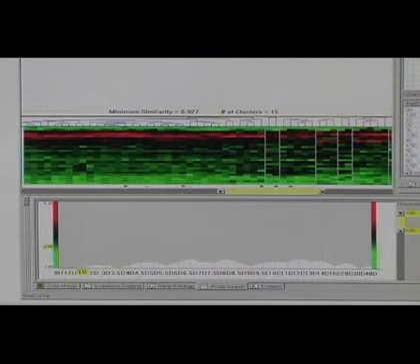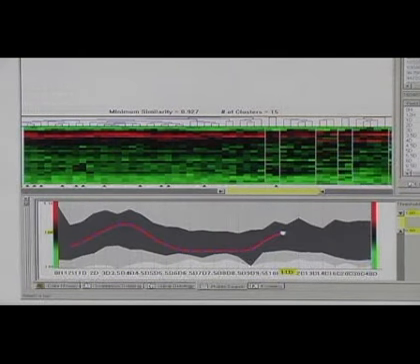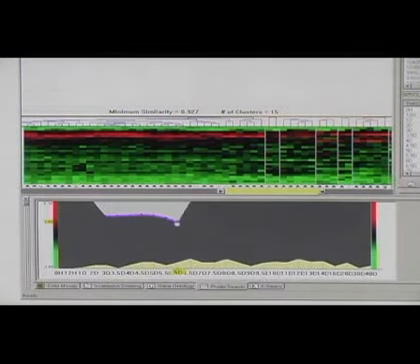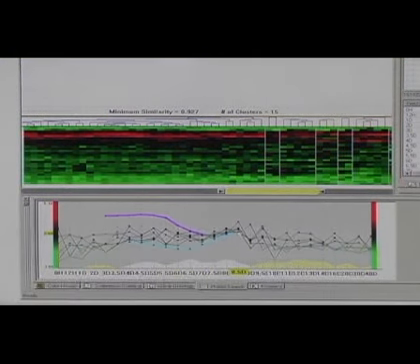Multidimensional and multivariate data exploration is difficult, but we hope that the interactive tools of HCE 2.0 will help researchers identify patterns, clusters, and outliers. Please let us know if it worked for you.